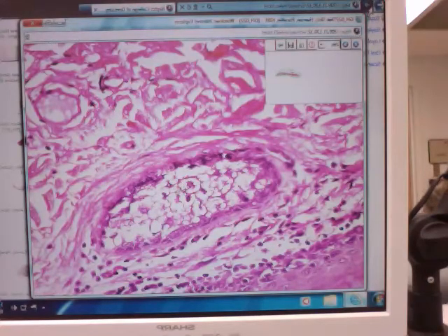So each individual little oil droplet, but I want you to notice the nucleus is in the center of the cell. Always in the center of the cell. Other places you don't see it, but for these sebaceous gland cells, it's always in the middle. And I'll contrast that in a minute from mucous glands that sometimes people get this confused with. Sebum or oil drop, and you see the individual droplet, nucleus in the middle, it's a dying cell, holocrine secretion. So that's going to be a sebaceous gland.